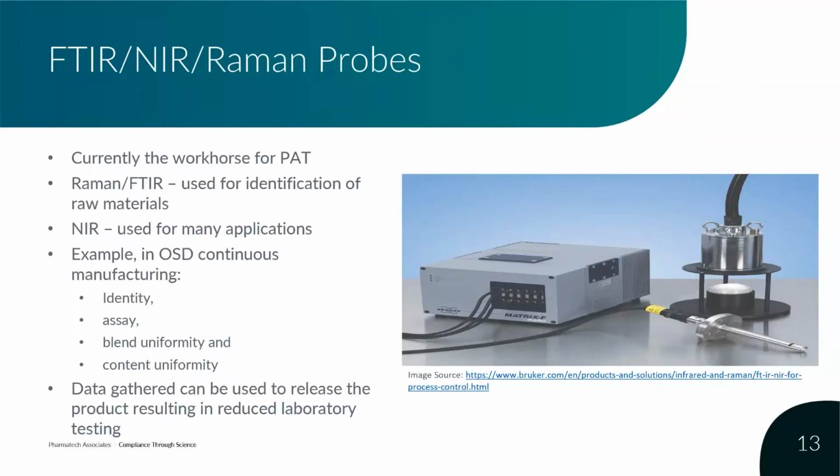Also, water has a fairly unique spectral signature, and it's commonly used to determine the water content, as we discussed, how important that was for the wet granulation process. All of these techniques are lumped into what chemists call vibrational spectroscopic techniques.